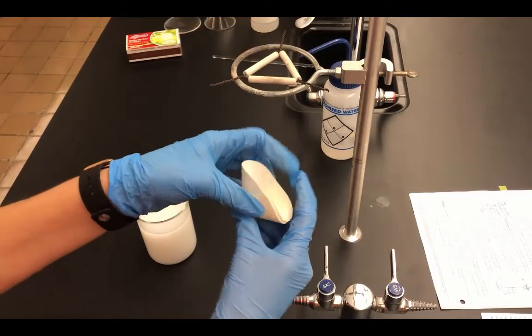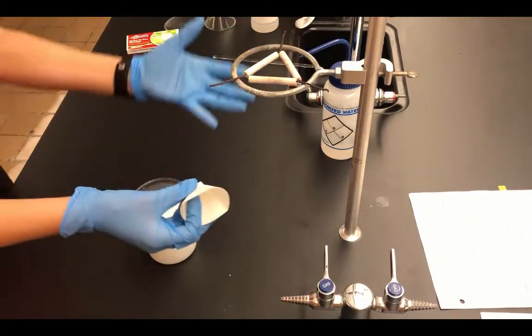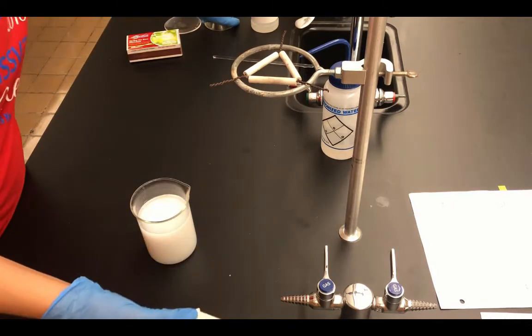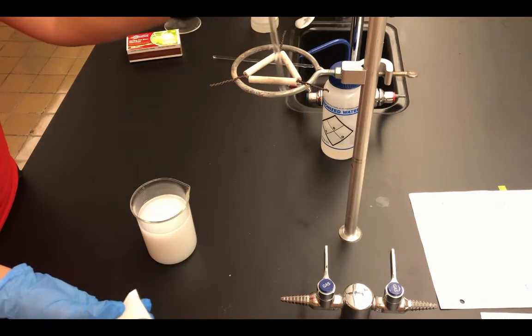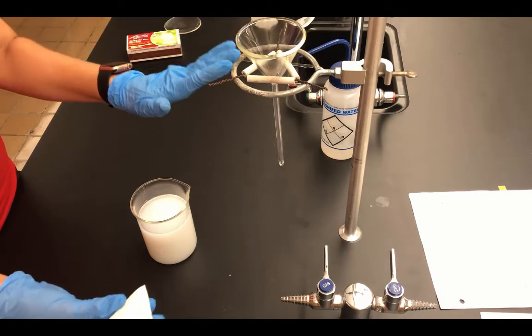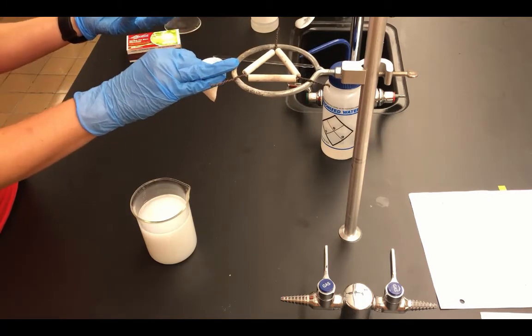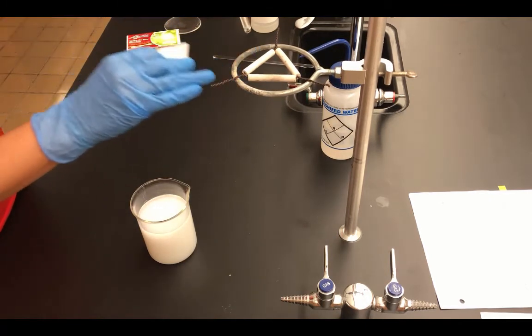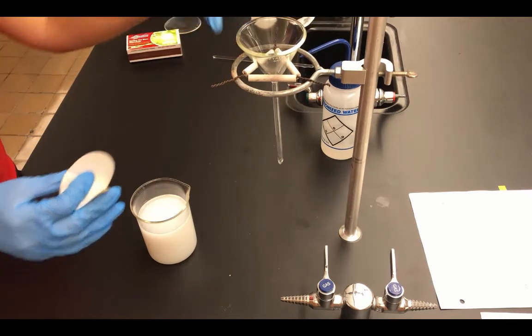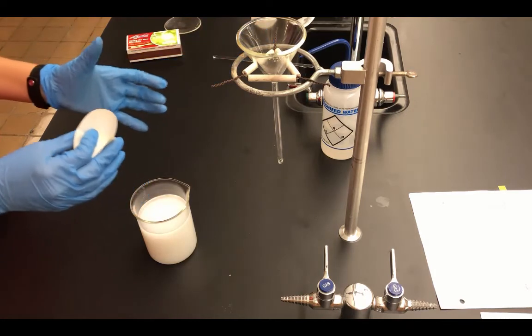All right, so here you have your filter paper. Now, I don't really have anything set up right now for filtering. I have my filter paper in my hand, and I'm going to take a funnel. We have glass funnels. I'm going to put it in the setup that we already had when we were using the crucible. Now this is cool. I have a clay triangle that I'm going to put the funnel into, because if I didn't have this clay triangle, it would fall right through the iron ring.